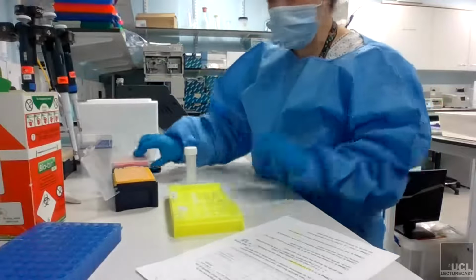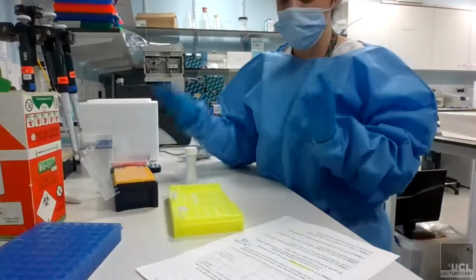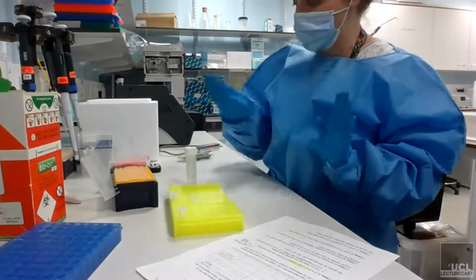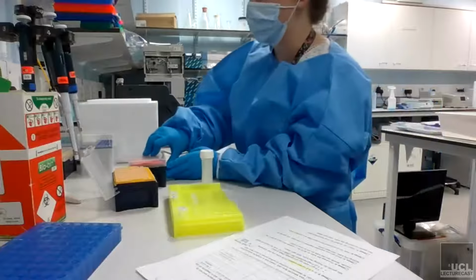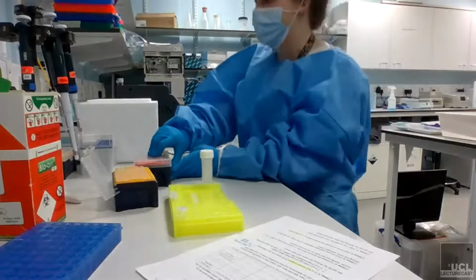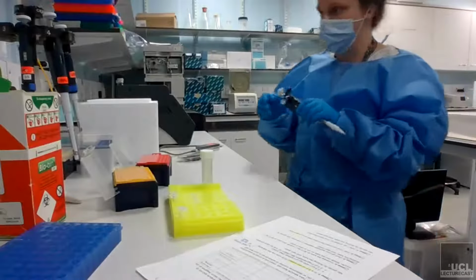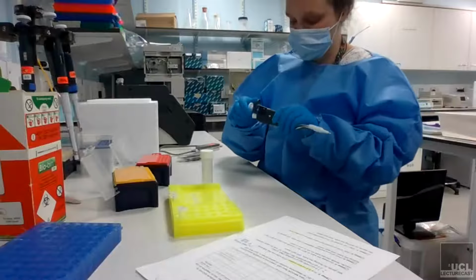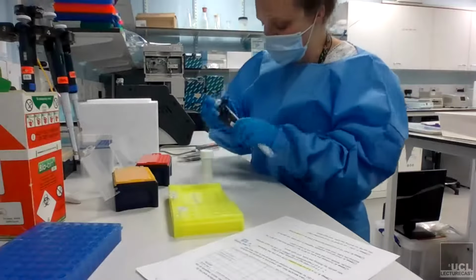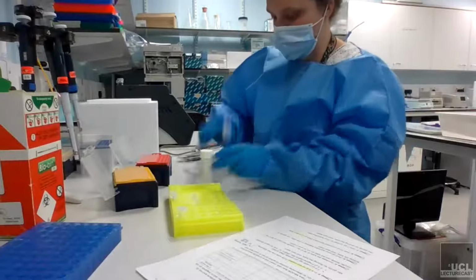But you need 7.5 microliters of your DNA. So whatever you've got with water and DNA, it needs to be a total of 7.5. I hope that makes sense. Excellent. So it doesn't really matter what pipette you use. I'm just, as I say, doing this for show. So just going to choose some numbers.